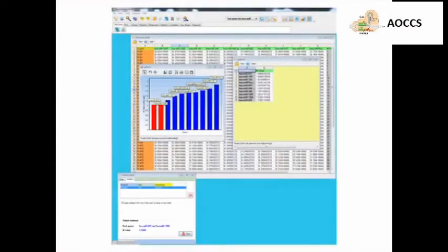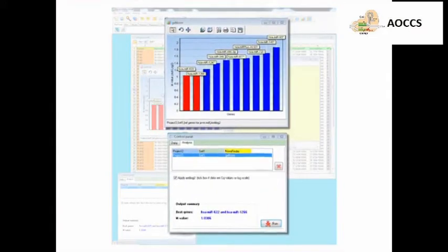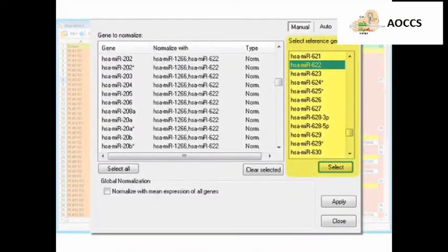Define reference genes by selecting a list of microRNAs that have similar CQ values across all samples, and run GNorm. Next, normalize the data using the obtained reference genes. The resulting values will correspond to the Delta CT.